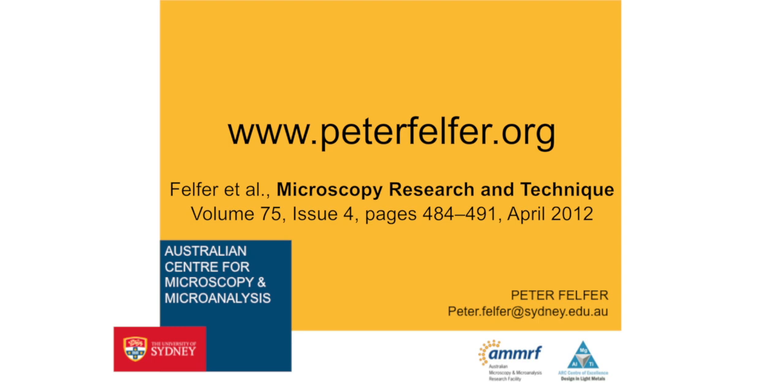And one last thing that I want to say about everything that was in this tutorial. Everything that was in this tutorial was done at an ion beam acceleration voltage of 30 kilovolts, 30 keV. So this is the most standard setting in most of the focused ion beam systems. I know that Hitachi uses 40 keV for some strange reason, but most of the systems will run on 30 keV. Up to a certain point, it's actually okay. So as long as your lift-up piece is larger than a micron in any direction, that's okay.